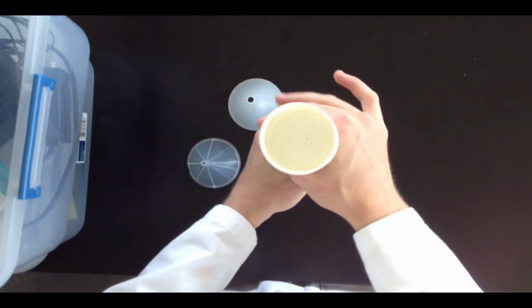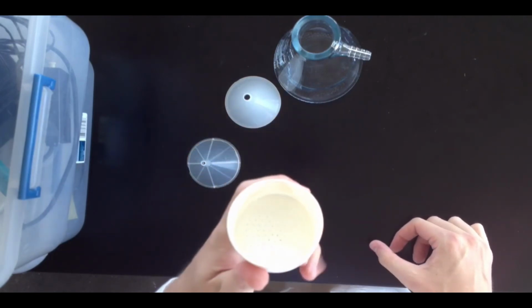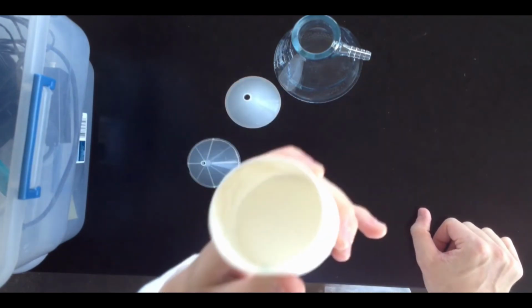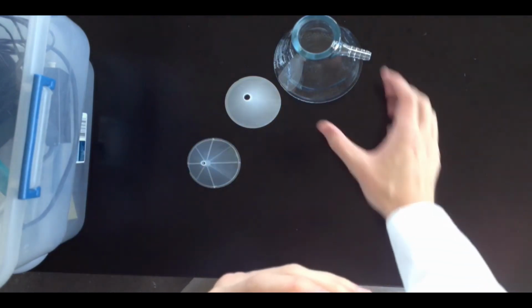So the purpose of the Buchner funnel is for filtering mixtures only. And you wouldn't want to use this to, for example, deliver solid or liquid because the holes in the top of the funnel are really small. The purpose of that is to catch large chunks of solid before they go through the filter flask into the liquid in the bottom.